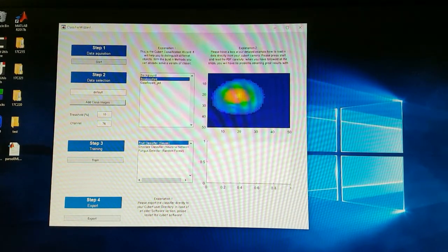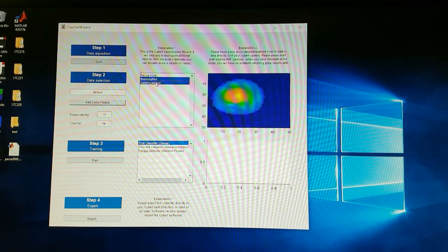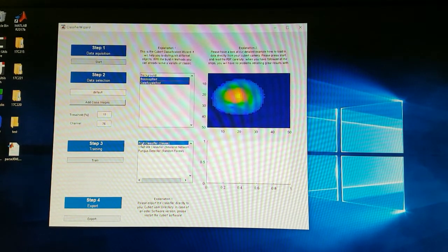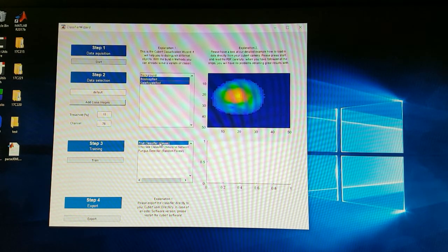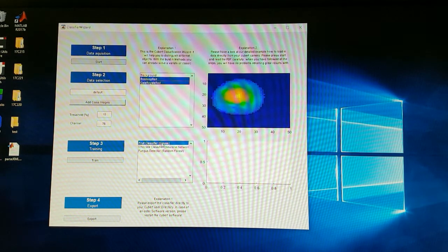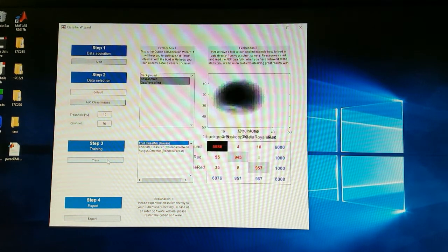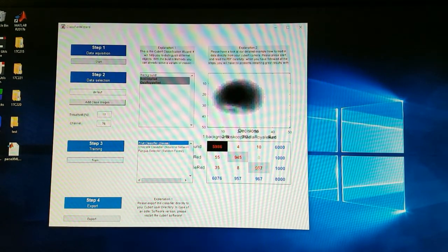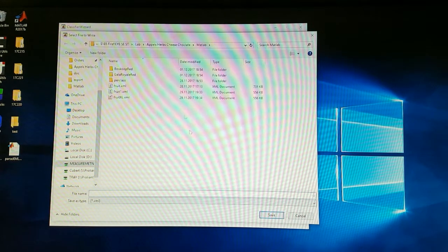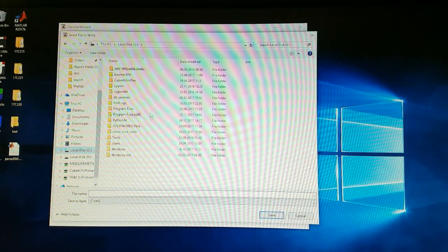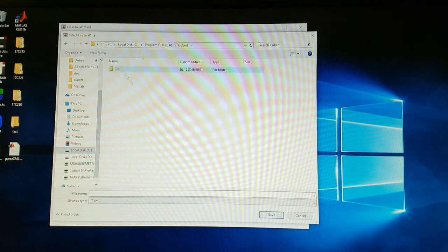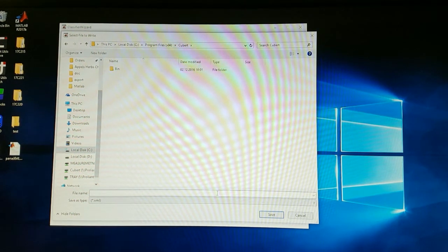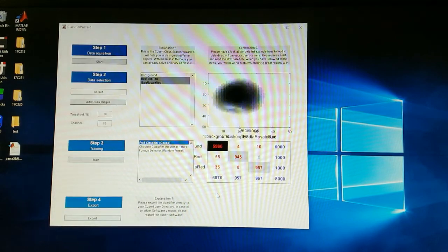Now we just select these two data sets because we want to distinguish them. And we set a fruit classifier, which was pre-programmed by Cubert. And just press train. It will now show you a small graph. And now we just export the data to our program folder into the Cubert directory. We call it apple and save it.